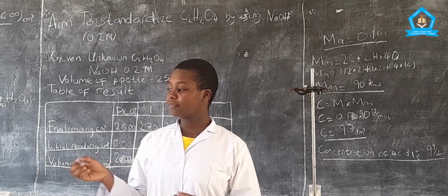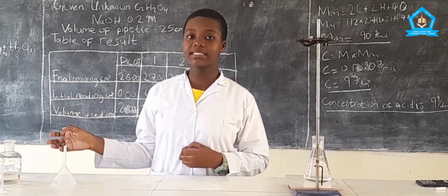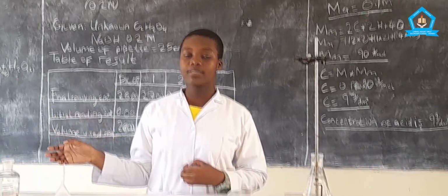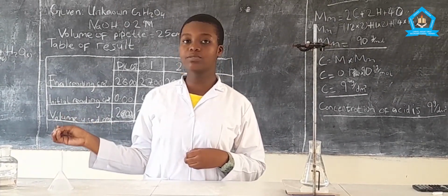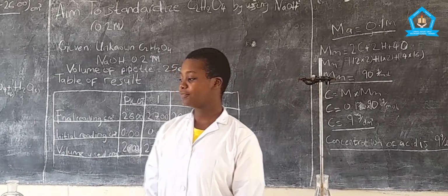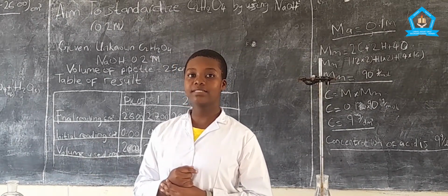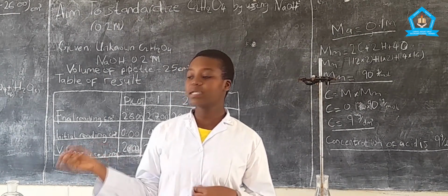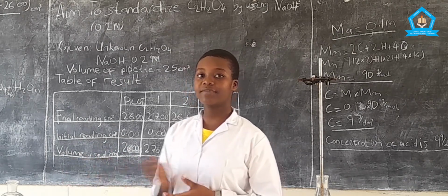Also, when filling the burette, you need to be very careful to avoid putting base in it, because it will form sodium silicate when it reacts with glass, which will make it stick and hence it will not function anymore. You should not put base in the burette, especially sodium hydroxide, because it will react with the glass, forming sodium silicate, which will cause the burette to not function anymore.